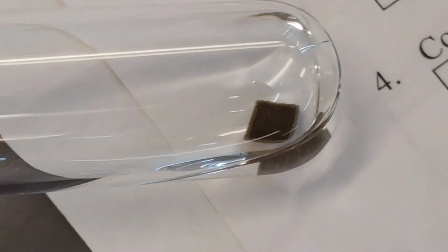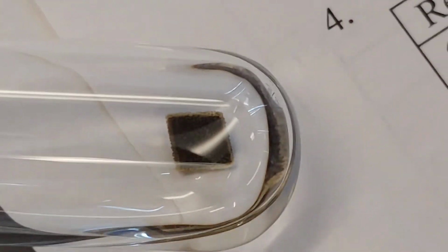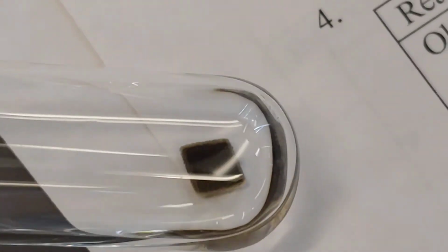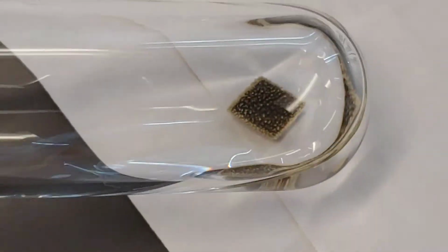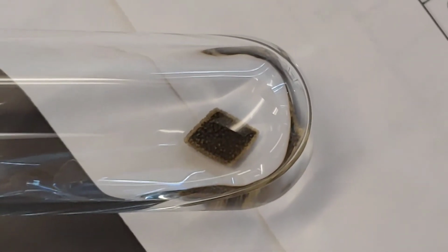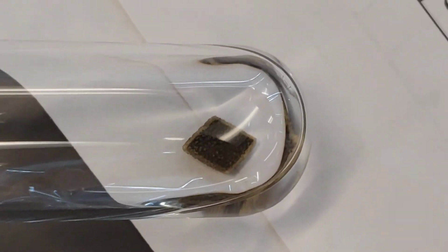Okay, there's my copper metal in the silver nitrate. Now maybe you can see a little more clearly what the color change is in that sample. Okay, so there you go. There's copper metal plus silver nitrate.